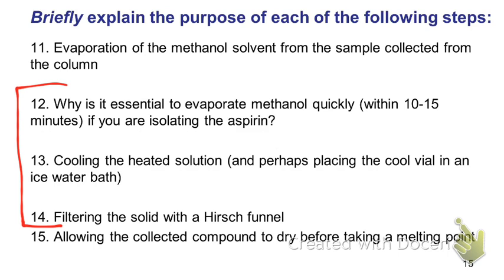Filtering the solid with a Hirsch funnel. What did I say at the very beginning? We're not filtering with a Hirsch funnel. So again, let's go back to why would we ever filter with a Hirsch funnel? To separate liquid from solid. That's why we filter. We're just trying to separate those two things apart.